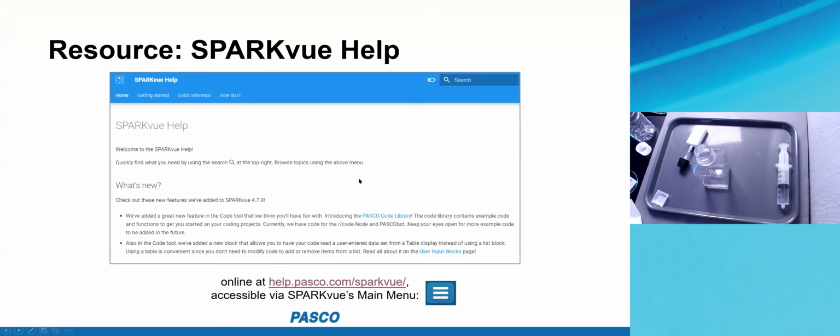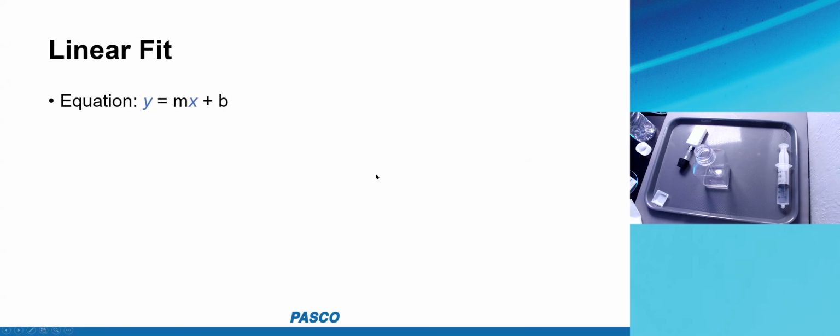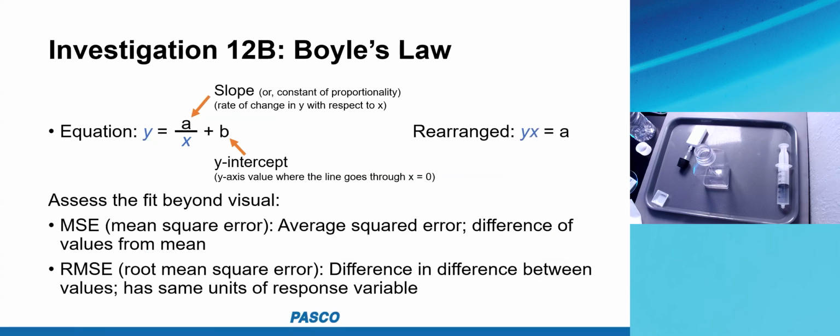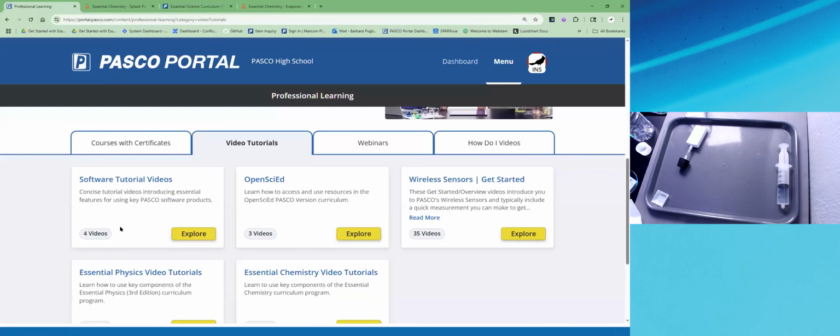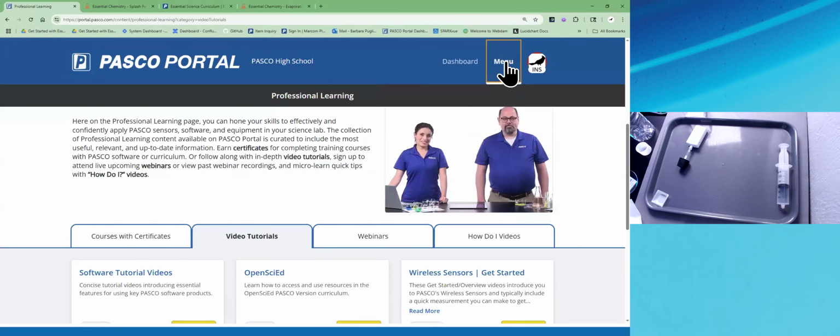Going back to my presentation, it looks like we'll have time to do Boyle's Law and a little bit about the pH sensor, but we won't have time to do that physical or chemical change thing. But because I didn't have time to go through it, you can go from Portal.